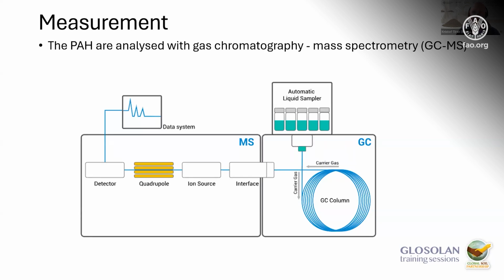And these deuterated products are widely commercially available, especially for all the PAHs? Yes, for the PAHs, it's no problem to find the internal standards. You can find them everywhere. It's only for certain exotic or new components that it is sometimes difficult to find an isotope labeled standard, for instance, for the newest PFAS. Every week there are new isotope labeled PFAS on the market, but for PAHs, that has been available for 20 years. That's no problem.